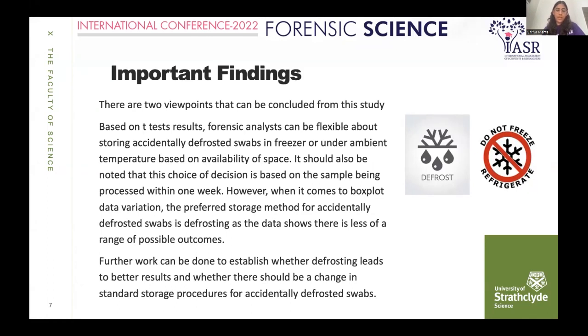Further work can be done to establish whether defrosting leads to better results, and research is needed to determine whether there should be a change in standard storage protocols, where forensic labs currently just refreeze accidentally defrosted swabs. This study suggests that defrosting might be a better option.